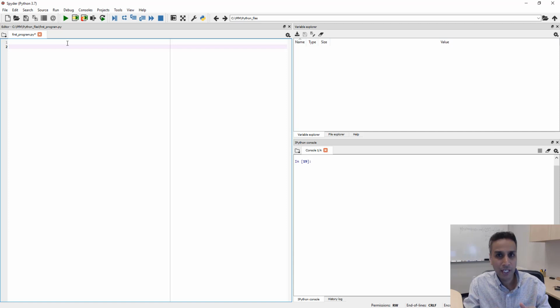And if you use ImageJ, you know that you can actually load any proprietary image, whether it is from Zeiss, Olympus, Leica, Nikon, whatever microscope you have, or DICOM formats. If you're working with CT scan images, Bio-Formats is this one versatile toolkit that enables you to load any image, any format, and save it into any other format. And their recommended format is OME-TIFF.